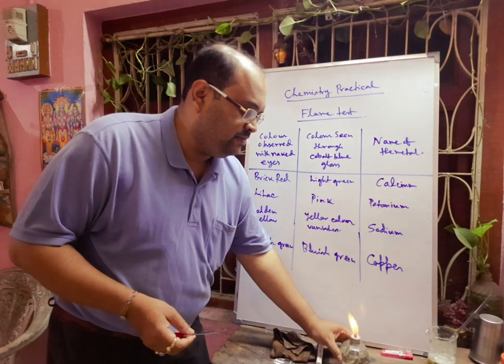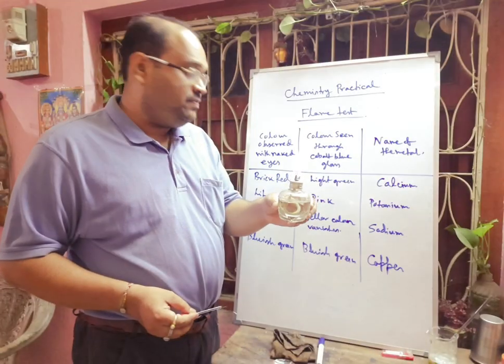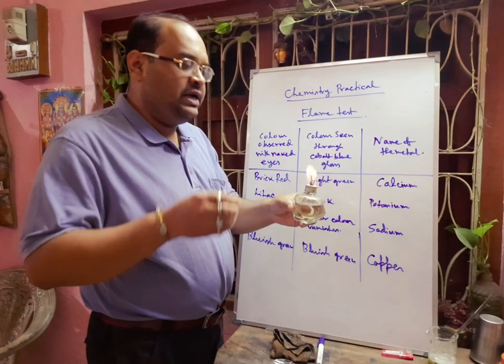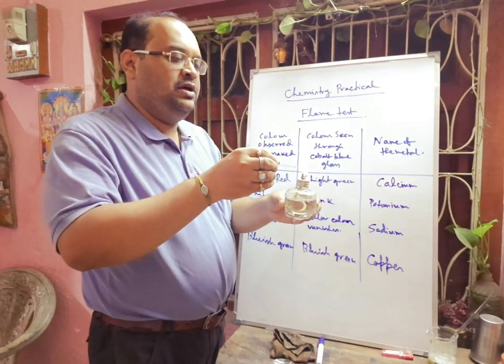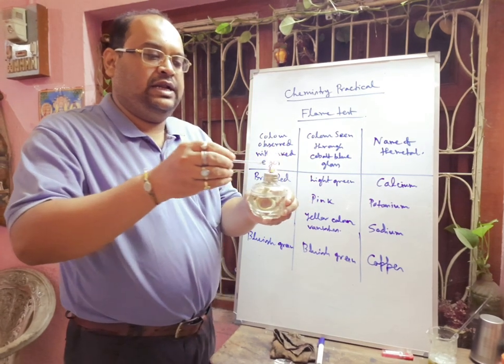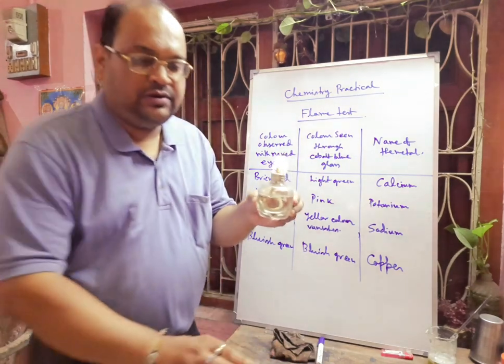Now, here you see the flame — you will get some brick red color. The color is not persistent; it will come and go. You can see the brick red color appearing.